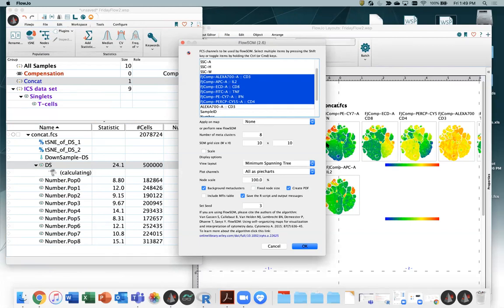I have not picked a particularly high dimensional data set here. I want to make sure I found one that had some differences in populations and to try to make this go fast, since a few of these are intensive operations and I did want to concatenate and feed it a lot of cells. So anyway, sticking with seven dimensional data at this point. Everything we say here in 7-dimensional space applies to 20-dimensional space, just it'll take a little bit longer.